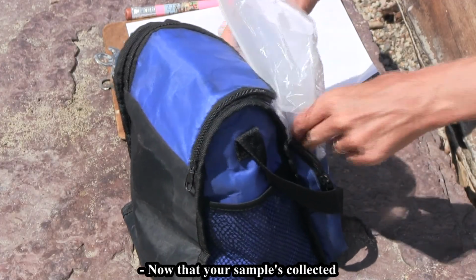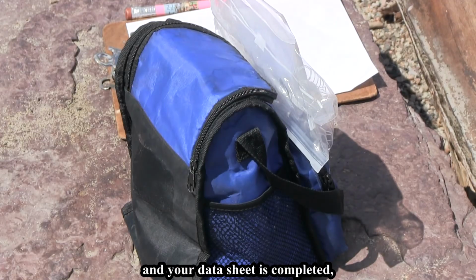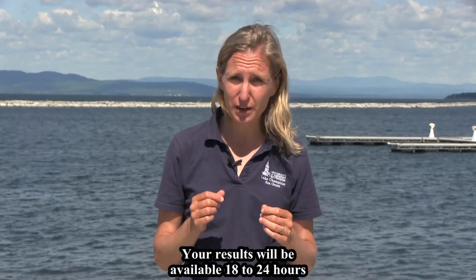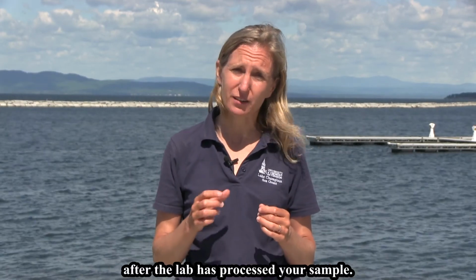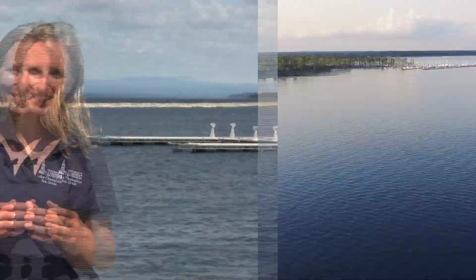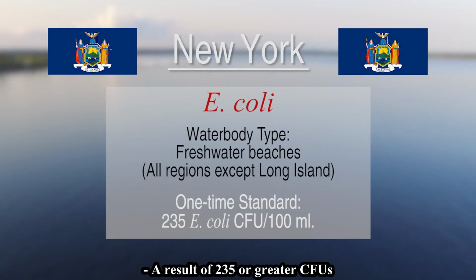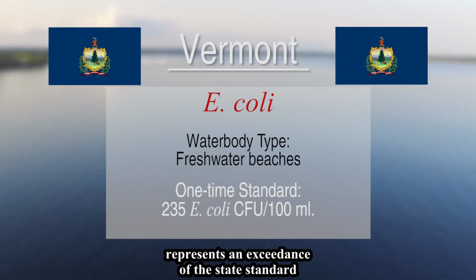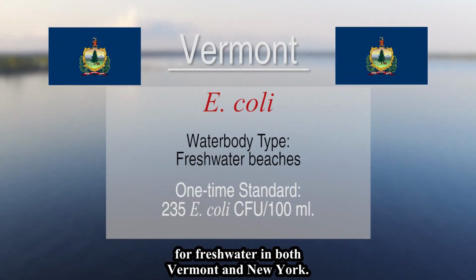Now that your sample is collected and your data sheet is completed, deliver or ship them to the lab where your sample will be processed. Your results will be available 18 to 24 hours after the lab has processed your sample. A result of 235 or greater CFUs, or colony-forming units per 100 milliliters, represents an exceedance of the state standard for fresh water in both Vermont and New York.